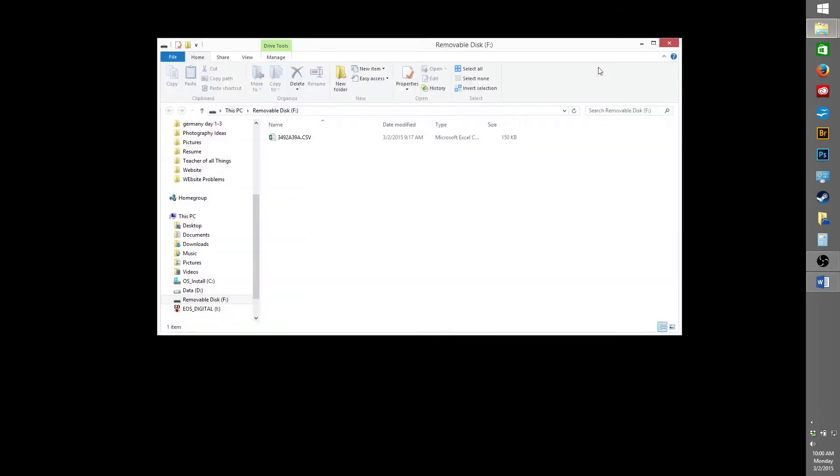Once you have downloaded your data to a USB drive, you can now download that data to your computer to view it. Begin by inserting your USB drive into your computer. Windows should automatically ask you what you would like to do, or your USB will automatically open like I have here. If it asks you what to do, make sure to click on Open Folder to view files, and it will take you to this folder.